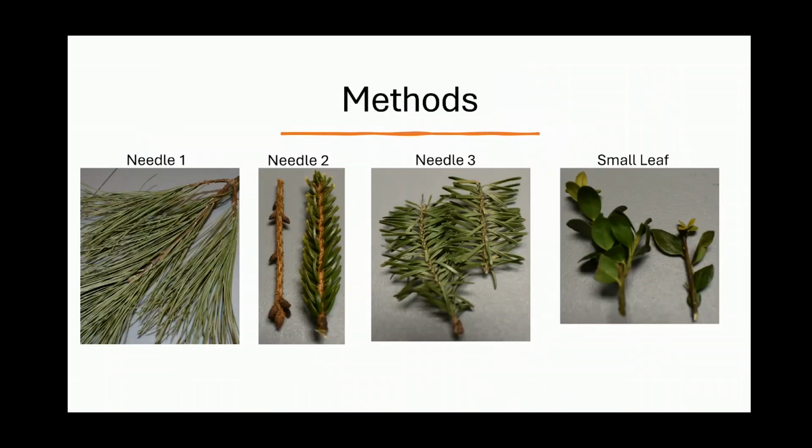So these are some pictures of the different pine needles that we chose to use. The goal of choosing these pine needles and species was to get a representative sample of different geometries of the needles and leaf shape, as well as different sizes.